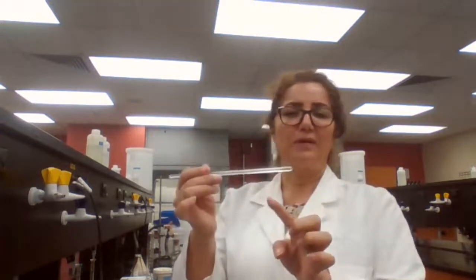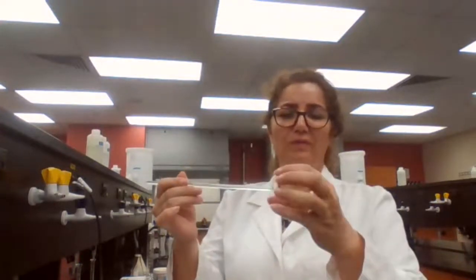Other times, you can dip your stirring rod into the solution. Because the solution is a mixture of solid and liquid, you take the stirring rod out and let it dry. When you let it dry, the solvent is going to evaporate from the surface.